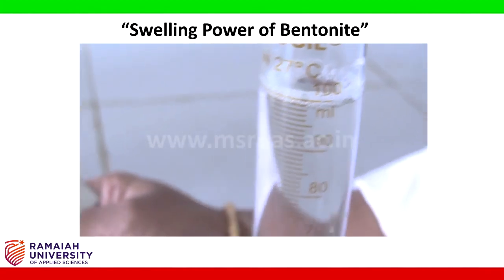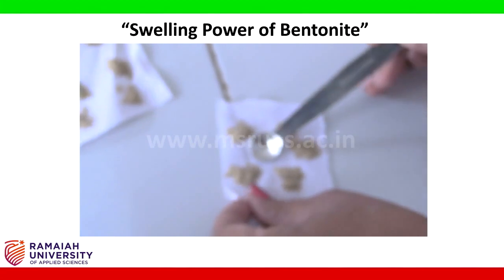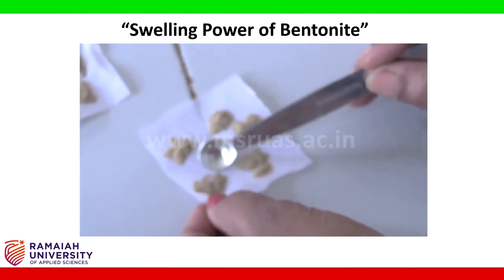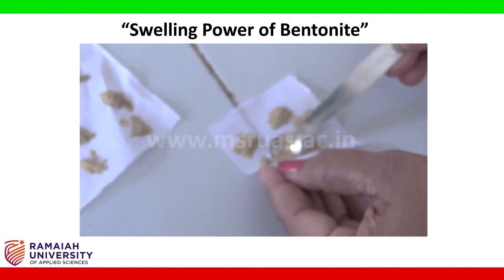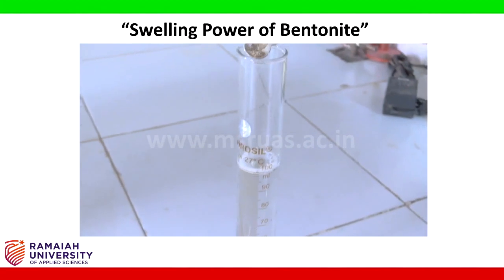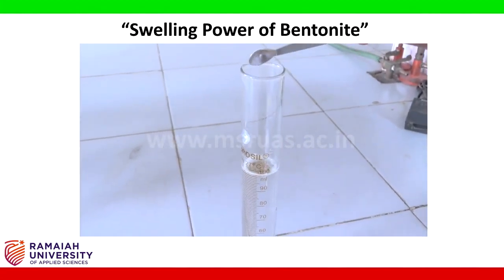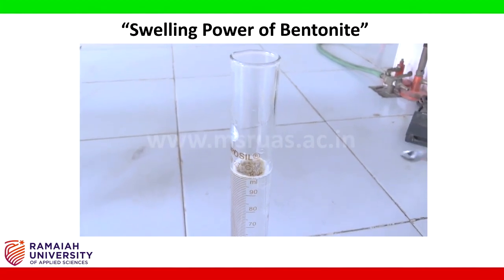Now add one part of the bentonite into the measuring cylinder.